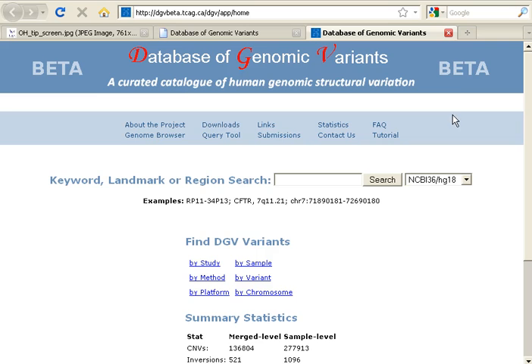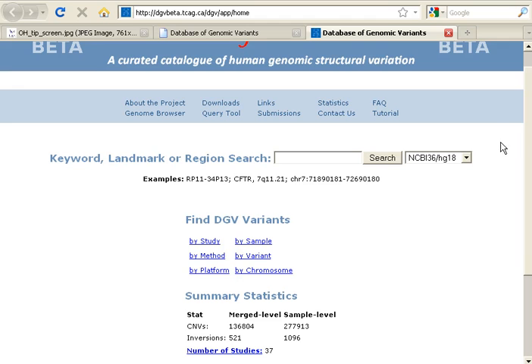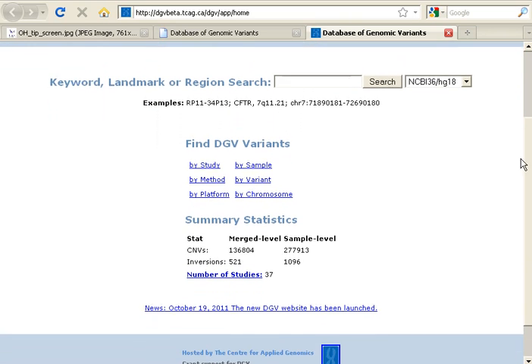Currently, this updated DGV is a beta version, so they are still welcoming comments and it's not 100% stable. We have some of the same things that we saw in the original DGV, such as a quick search and a link to the genome browser. They also have facts here, and there's a tutorial on this beta site so you can get more familiar with some of the changes.